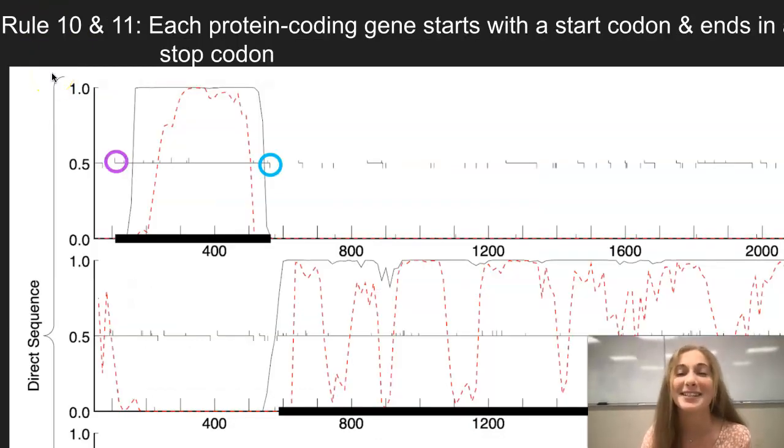Rules 10 and 11 talk about start and stop codons. On this screenshot of GeneMark right here, within this purple circle, this uptick signifies a start codon, which starts the coding for this gene right here. Start codons are made up of three nucleotides, and the start codon of TTG only happens 10% of the time.